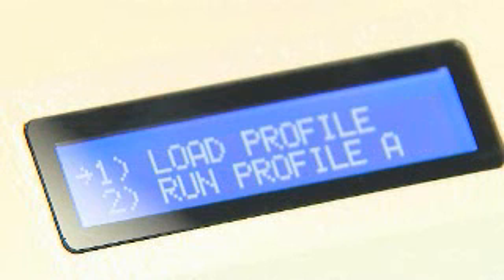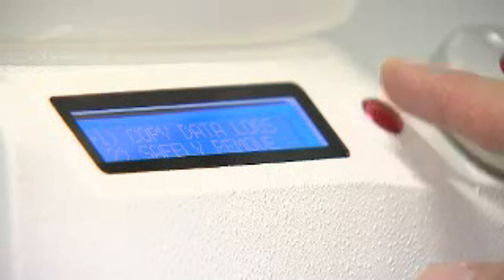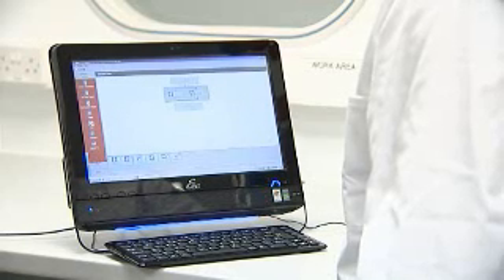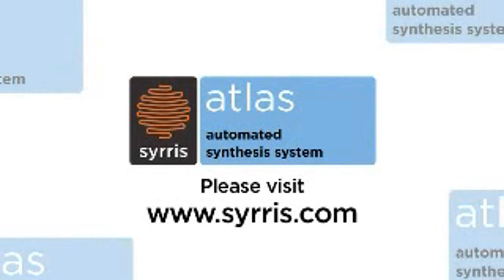Atlas also allows heating, cooling, stirring, and reagent addition profiles to be created and run automatically from the Atlas base, with full data logging and control of systems in parallel using the Atlas software. Atlas simply does it all. For more information on different functionalities, see our other videos or contact us at www.syrris.com.